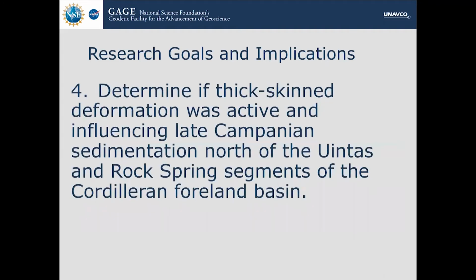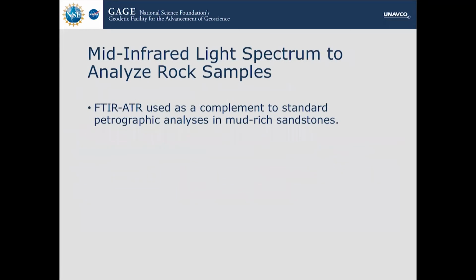I also wanted to determine if thick-skinned deformation was active and influencing sedimentation during the late Campanian, north of the Uintas and Rock Springs segments of the Cordilleran Foreland Basin. So, how I used this mid-infrared light spectrum to analyze the rock samples: I wanted to use it as a complement to the standard petrographic analysis in mud-rich sandstones.